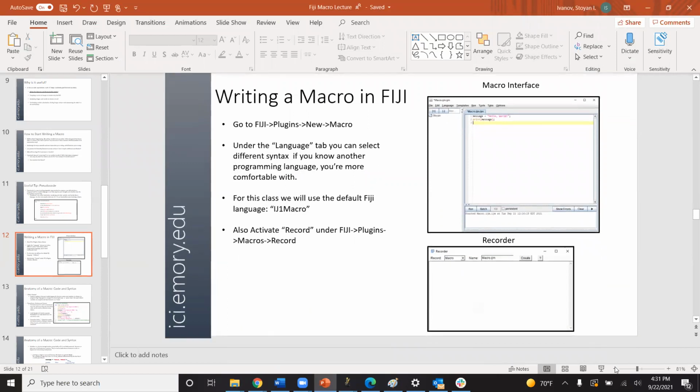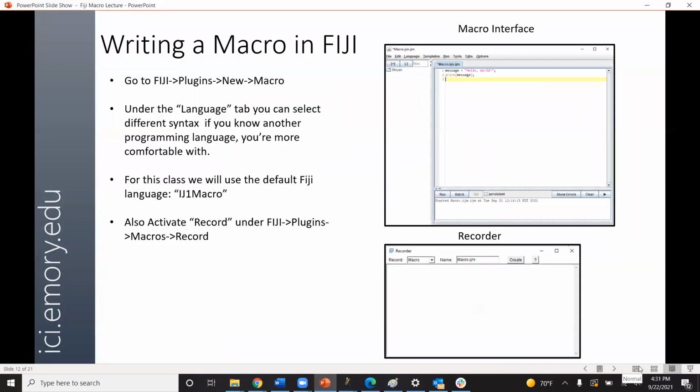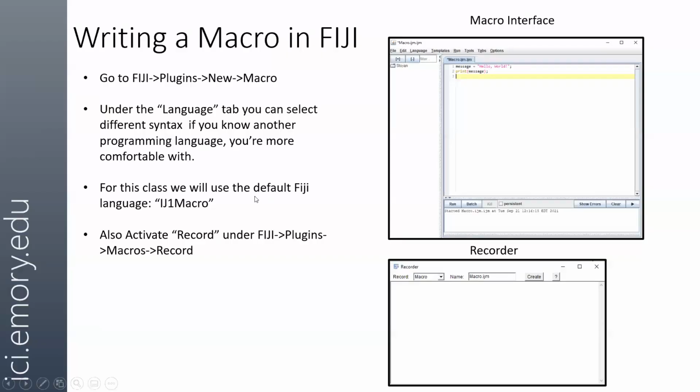Now, there's still a bit more of an introduction to macros and programming, so we'll continue with that. We'll come back as I take you through an entire macro, and we'll in fact play with the recorder so you can all get a sense of how it works, how it's used, and what its limitations are.